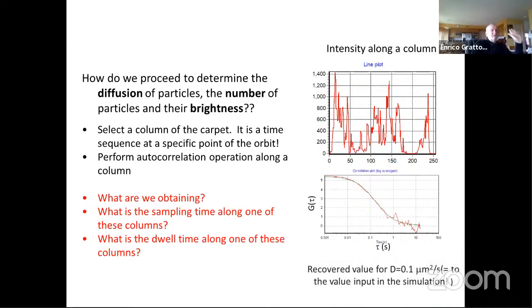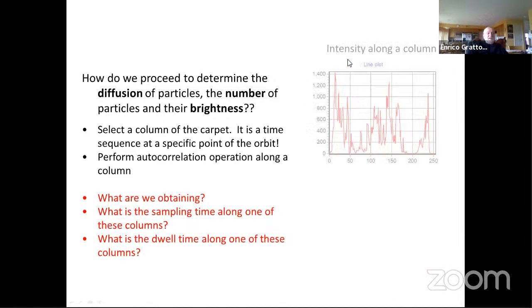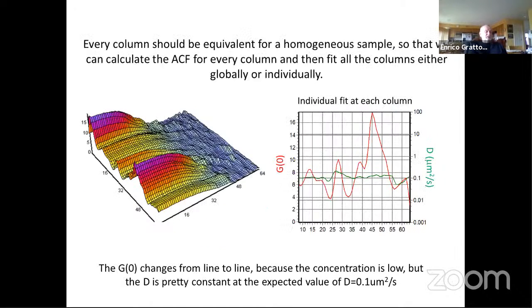But now let us discuss what happens, for example, when we take the intensity at one particular column of this function. On one function of this, we obtain just a normal correlation function, which is what we would obtain if we have essentially a particle diffusing. And that is what she wanted to show. But actually, there is much more information here. Now let us open a different kind of application and see the information that we can obtain here.